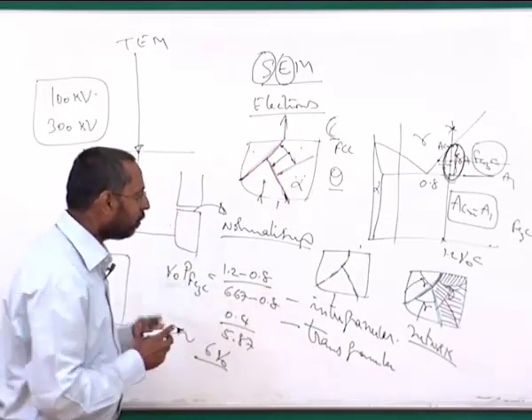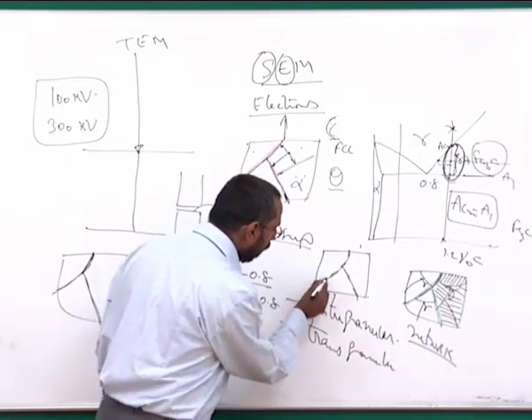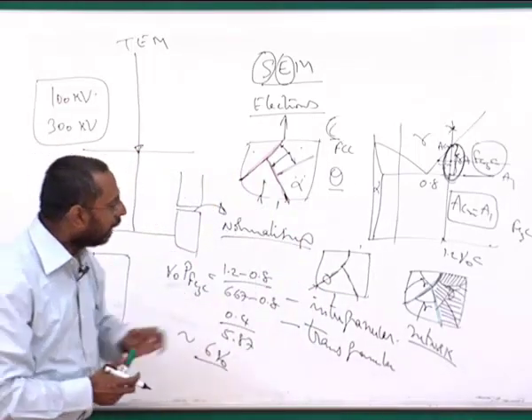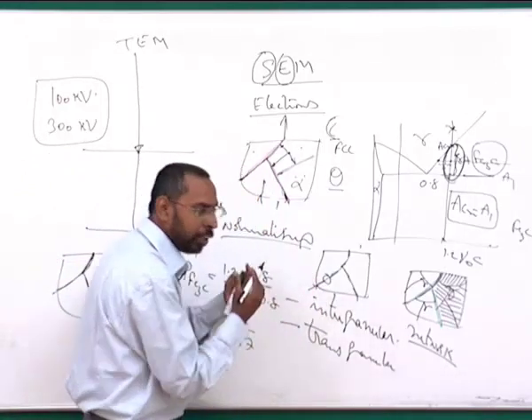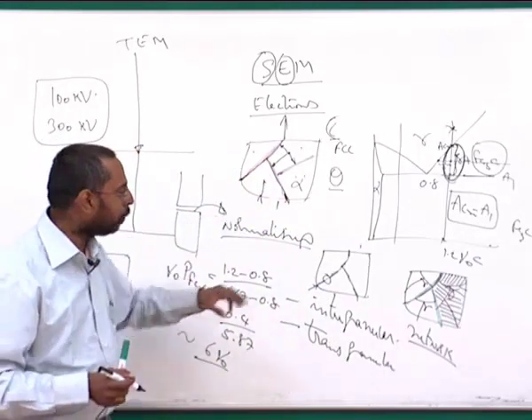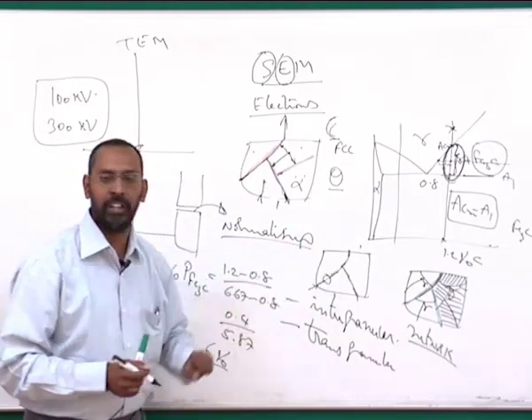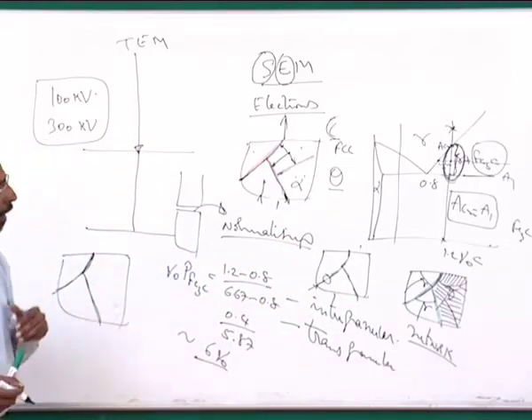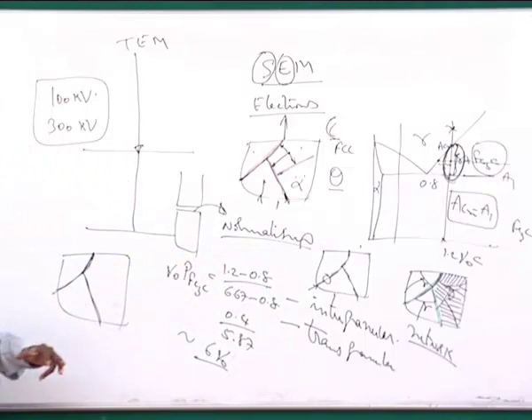And once you have a discontinuous network, if a crack is, let's say, trying to propagate along the grain boundary, the moment it comes across a region where there is no cementite, it cannot propagate further. Because this region is not as brittle as that region, it offers certain resistance to crack propagation, and hence you will see some crack blunting starts happening in these kind of regions, and then the material will not be as brittle as you otherwise would have expected, and that gives you better mechanical properties in terms of ductility in the material.